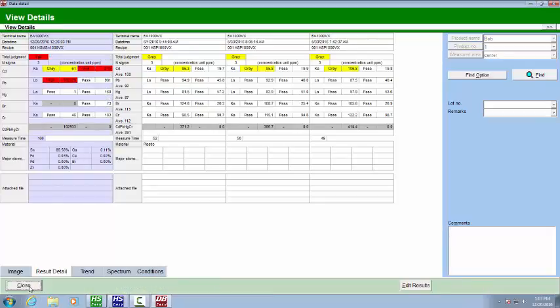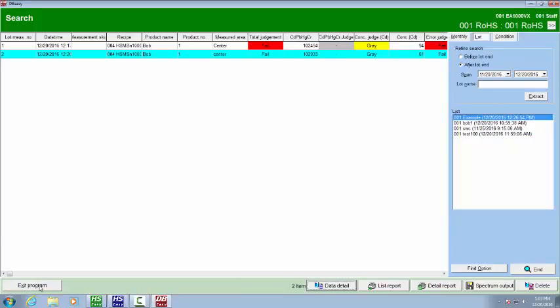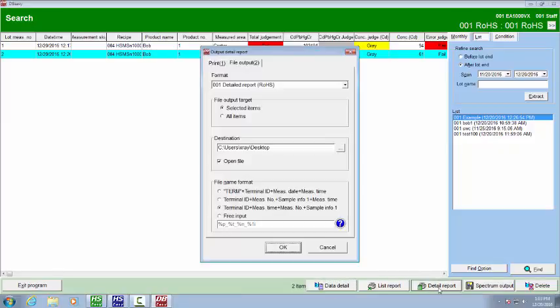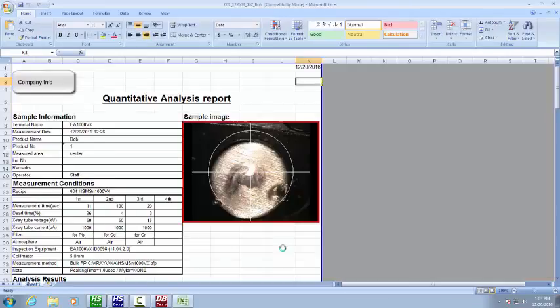Hit cancel. And we're going to hit close here. I'm going to show you the more detailed report of that. We're going to go to detail report down here. Everything seems fine. So we'll hit OK. And here's the detailed report.